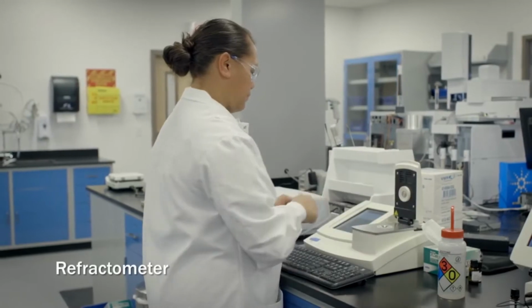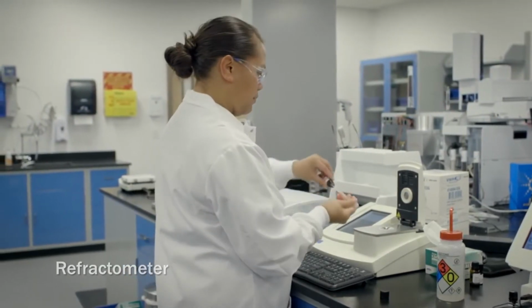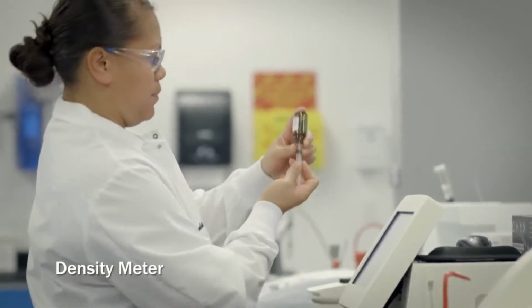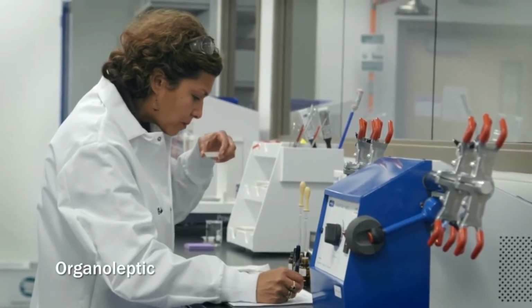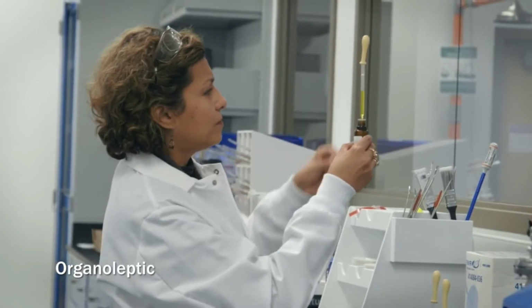A refractive index, which is done by a refractometer, because each essential oil twists light in a different way. And then the specific gravity, which basically measures the difference in weight between water and the oil. The other piece to the physical testing that we do is the organoleptics. Each oil is unique and it has a specific appearance and aroma and color, and we document those at every receipt of all the samples that we receive. And that is part of our release criteria for each oil.